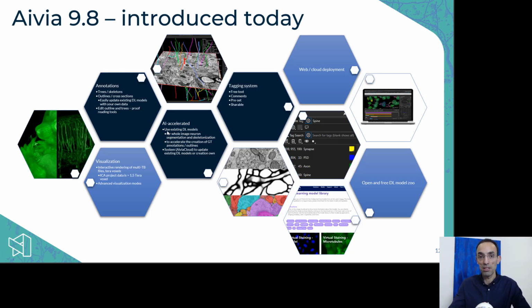So there's a little bit of variety that you can pick from to get started. And then once you find one of the models that works reasonably well, you can further augment that model with your own annotations. We do have, as I mentioned before, a system to train or augment your own models, and that's really important.